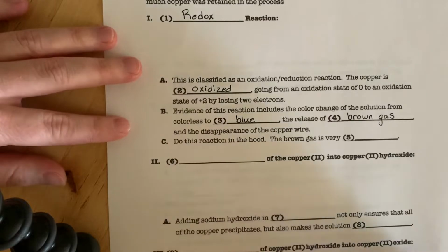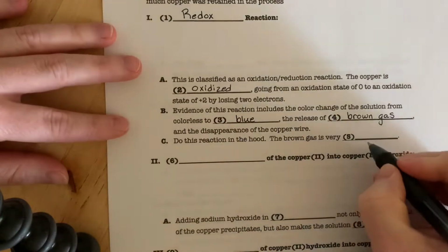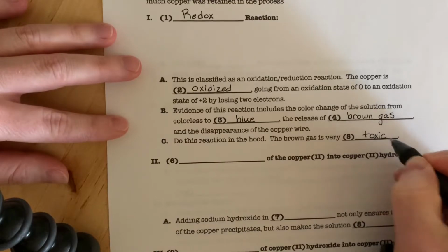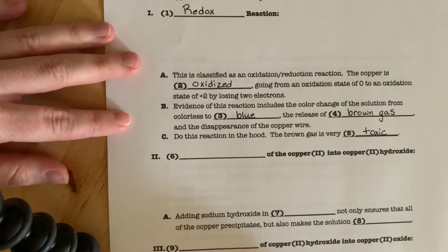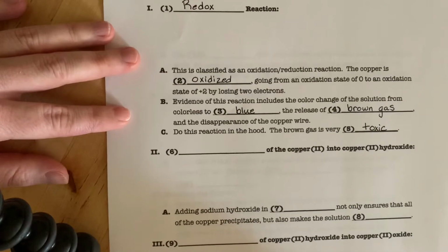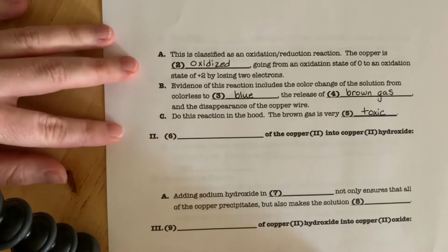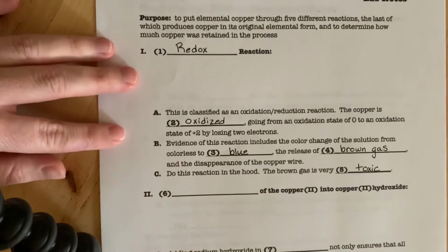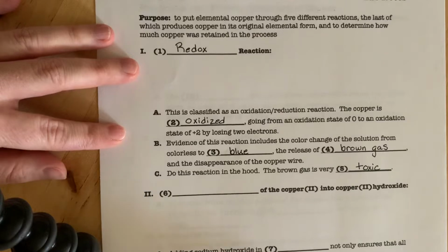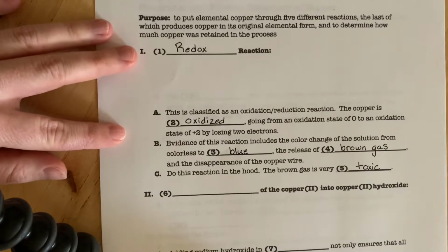And we actually have to do this one in the fume hood because the brown gas is super toxic. And not the kind of toxic where, you know, it'll give you cancer in 20 years. It's the kind of toxic that'll hurt you right now when you inhale it, so careful. So let's draw a picture of what that would look like. Let's draw a before and after picture of your principal species in solution.